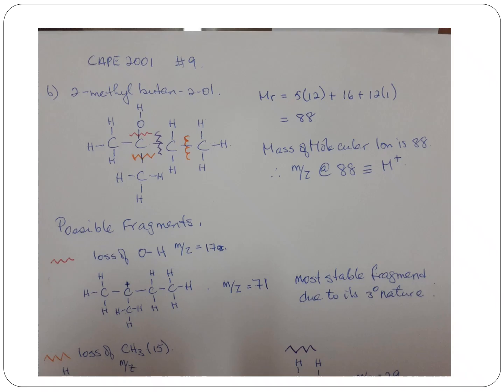In each of these, on this molecule, you'll see different squiggles, different colors, and different types. There are 4 possible places that I can consider where my fragmentation will occur, where pieces will break off and create a different structure that will have a mass. So the first thing you should do is draw your structure. Get in mind where things can break, where bonds can break, where things can happen.